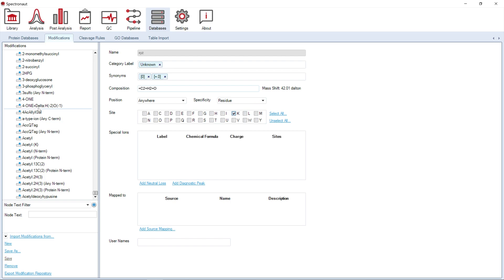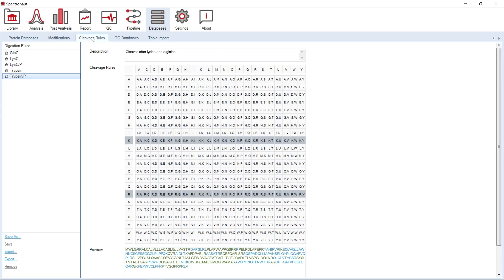Moving on, we can find cleavage rules. The tree on the left side contains protein digestion rules which correspond to proteases most commonly used in proteomics.